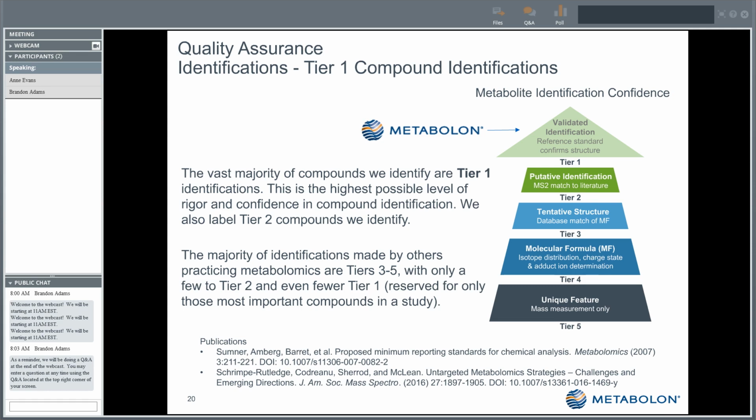So now I want to start talking about a slightly different aspect of what we do. We talked about the traditional quality control steps, but a lot of this is quality assurance: the processes that you have in place to look at the data post-collection to assess whether everything that had to happen happened well and that it is ultimately the best representation of the data.